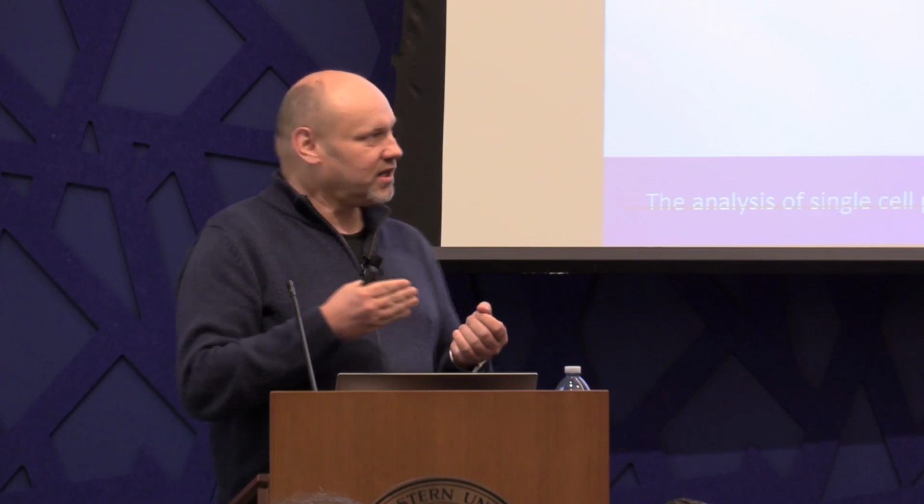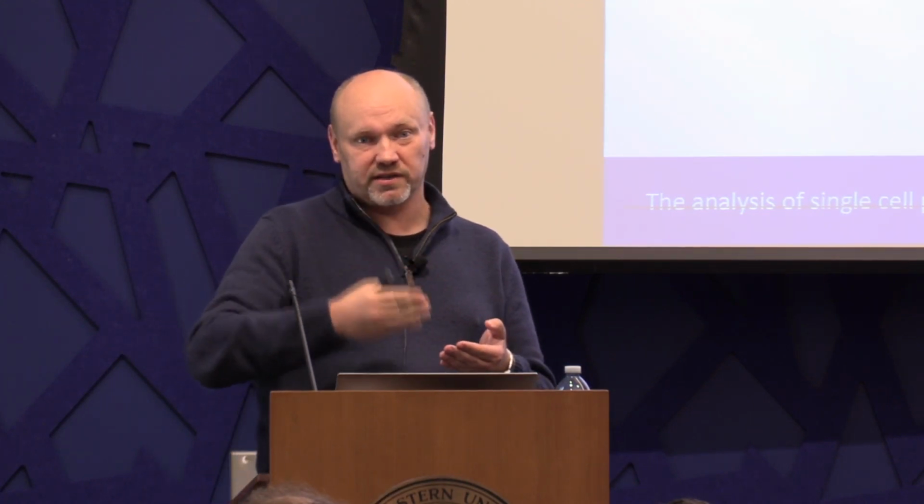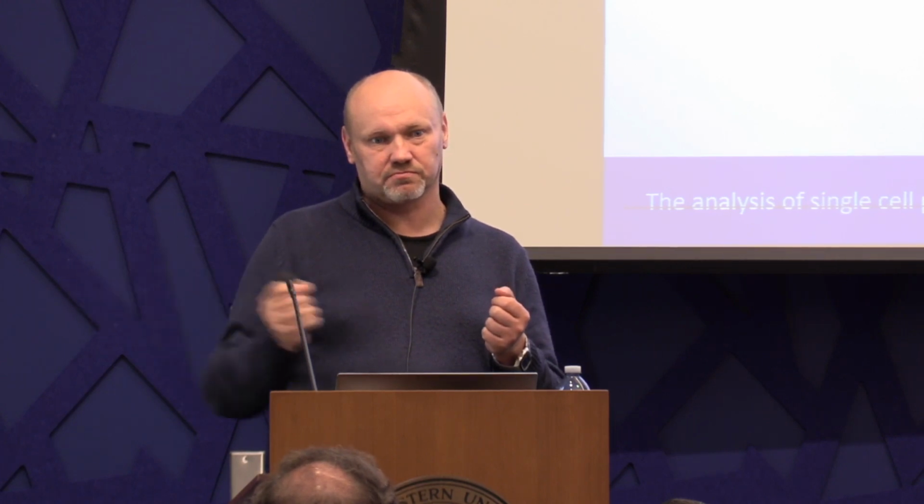First of all, it's the MS1 intensity exactly where this MS/MS has been taken, not the apex value of the peak or something like that. It's exactly the value where the MS/MS has been taken, and then we want to multiply it with the fill time of the MS2. That should be proportional to the number of ions that go into the fragmentation.